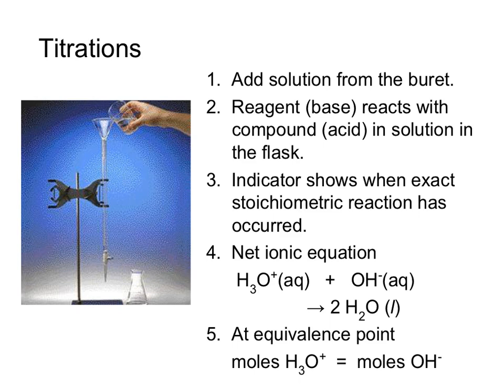This would be for an acid-base titration, but the basic concepts would remain the same for most types of titrations that you would do. At that endpoint, you would have an exact stoichiometric ratio. You would just use different indicators for different types of reactions to show you when that has been reached.